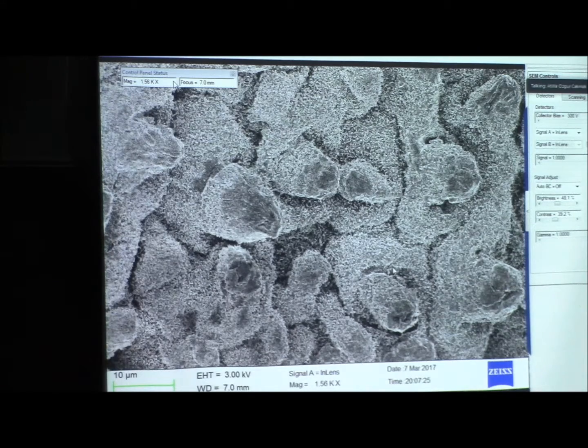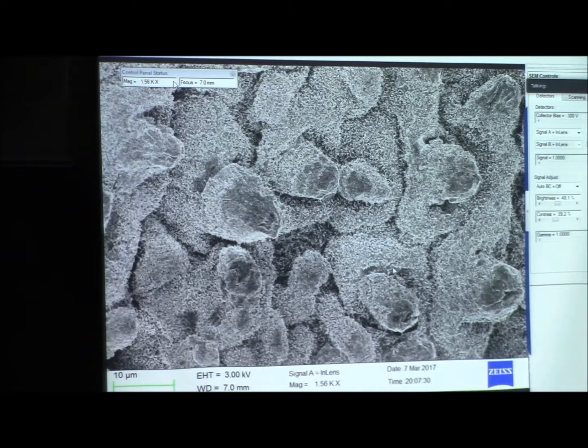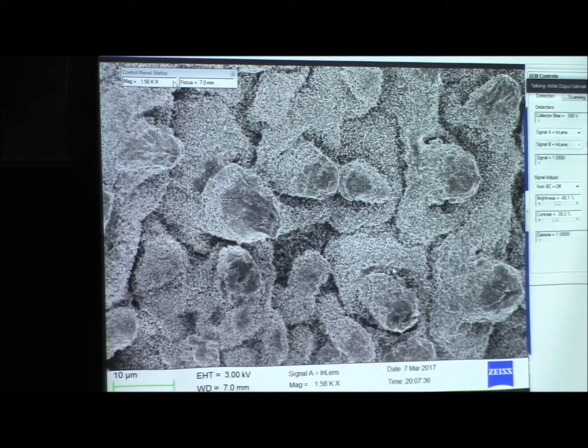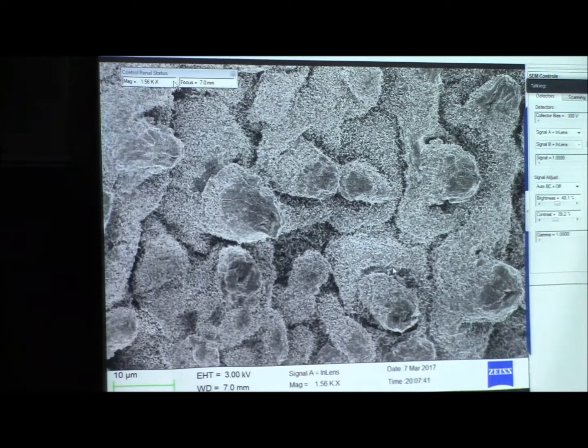And this is actually pretty related because here in our lab at CNU, we do nanocharacterization, but we also do nanofabrication.